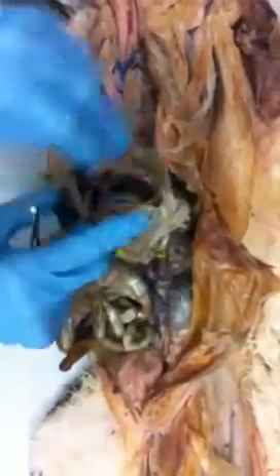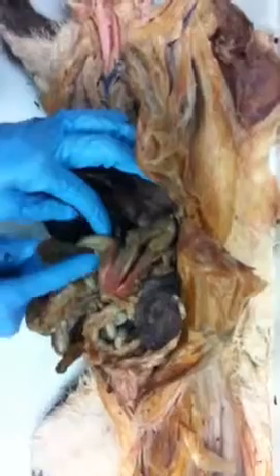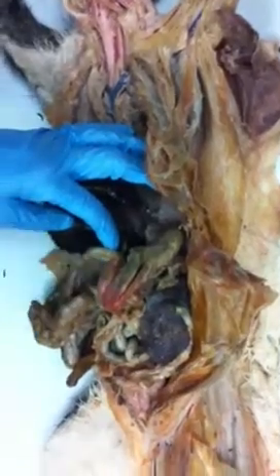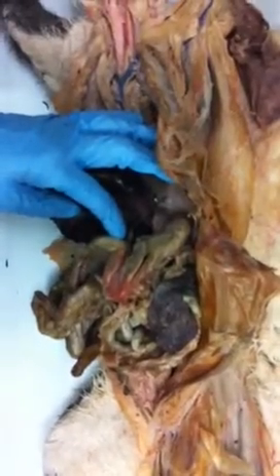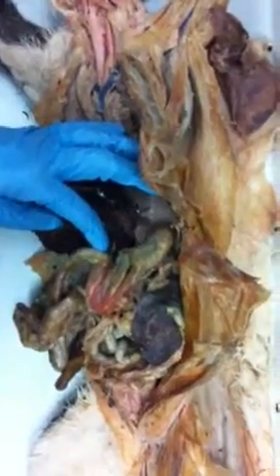And right where, it's really hard to see this, if you can even ever see it, right where the beginning of the duodenum is, there's a duct coming from the pancreas that's going to deliver digestive enzymes in a very alkaline solution. So it's going to immediately neutralize the acid coming in, and it's going to deliver all the digestive enzymes. Okay, so it's a twofer.